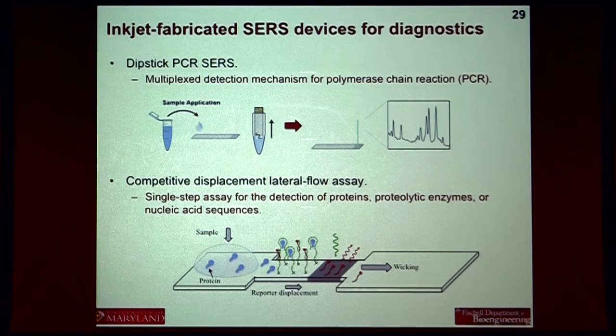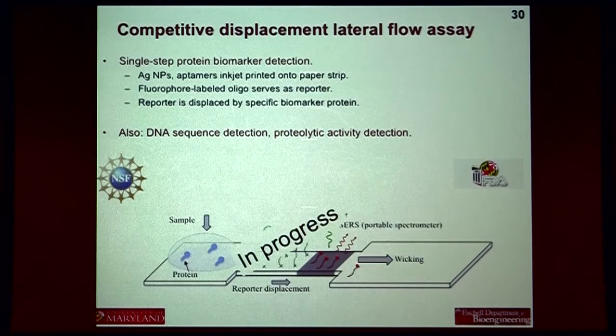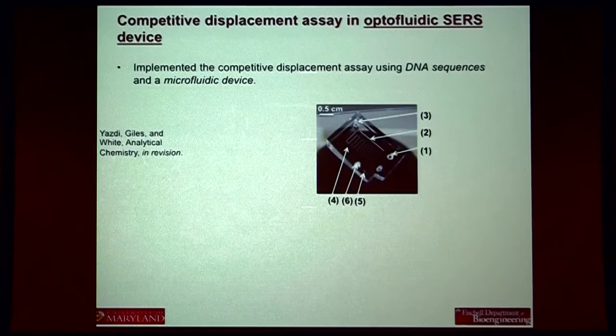And again, I really look at this as how do I design this simple thing to perform everything that a system needs to perform. Okay, so stepping back through there, this is in progress. What I'm going to show you instead is the microfluidic implementation of that. To understand the biosensing aspect, we first did it in microfluidics. So here's a microfluidic device.